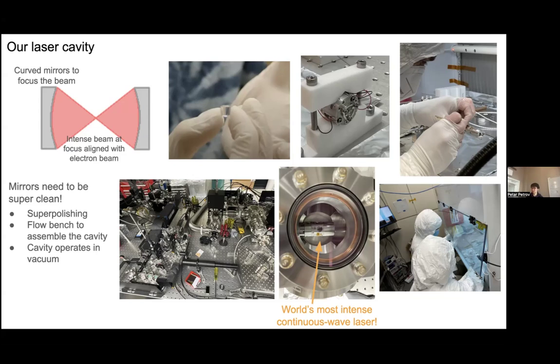So there's kind of a similar phenomenon. To make a really highly reflective mirror surface, you can stack two materials so that there's basically destructive interference for the wave that would go through, which means everything has to come back. I was assuming a lot of things would just burn if you put that laser in. It's designed not to burn with a high-power laser going through it.